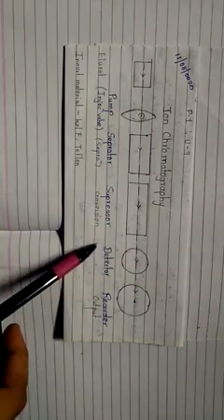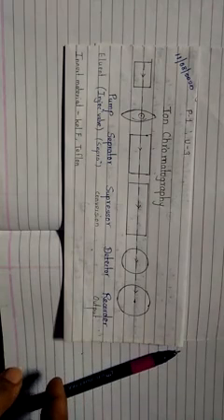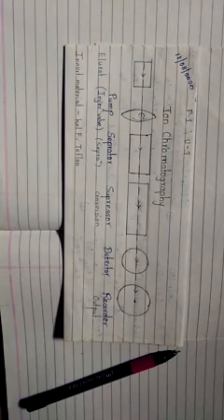Next is detector. Here different types of detectors are used, that are conductivity detector, photometric detector, fluorometric or amperometric detector. Here the intensity of conductivity is obviously related to the number of ions separated.